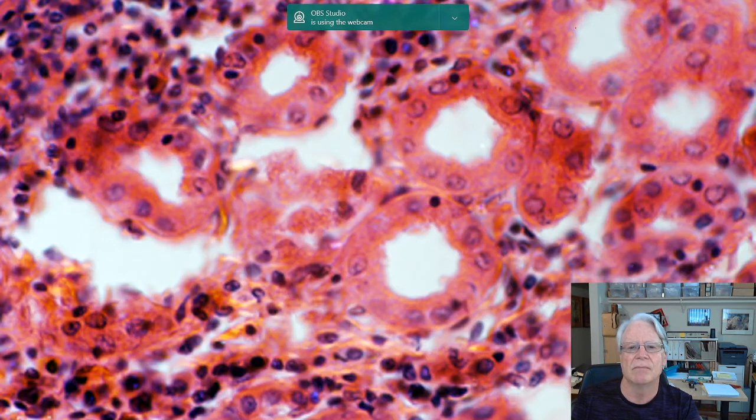Okay, all right. Now here's another image. It's a little bit harder to see, and you can't see really very well there. Let's go down. There you go. A little bit. Okay, so once again, I'm showing you this because you're going to see many different views of this, and we need to be able to identify and recognize it for what it is.